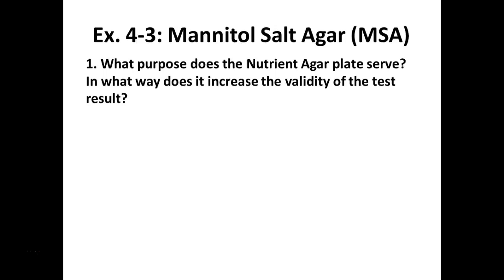Two of you, probably you've got yellow plates, right? Again, it's not Staph aureus, but it is a fermenter of mannitol. I would say non-fermentation on that one. I wouldn't say that's truly yellow on that one. And then yours, Amber, it's growth, not yellow, right? Okay.